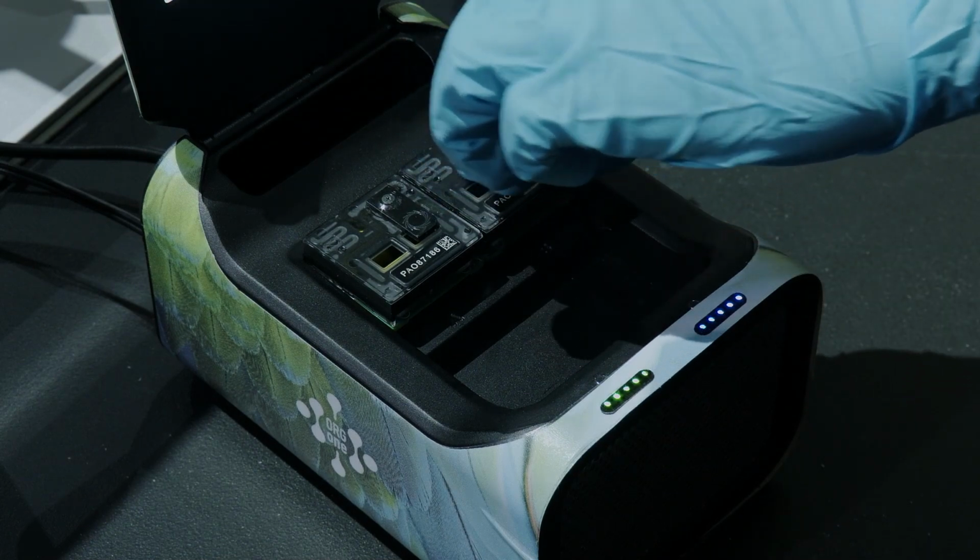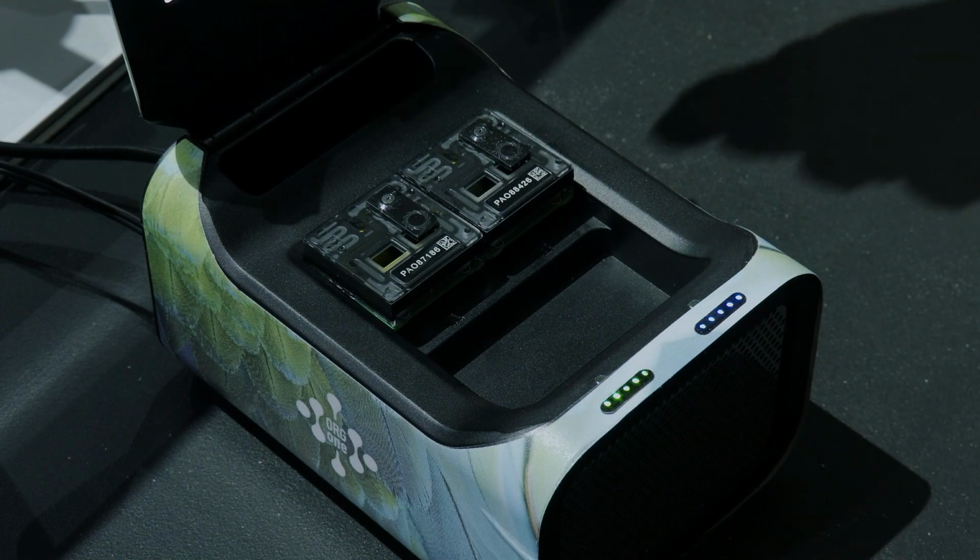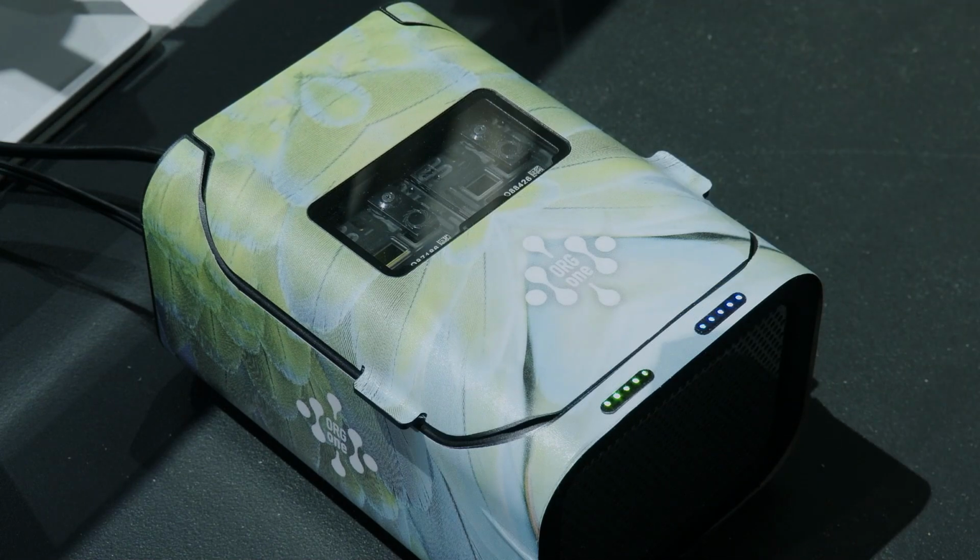Now, we're running 2 true ORG.one samples today. We're going to try and sequence and assemble them, and one of those is the large copper butterfly, and I have my friend here, Ben Price from Natural History Museum, who's kindly delivered the sample. Ben, would you like to introduce yourself?